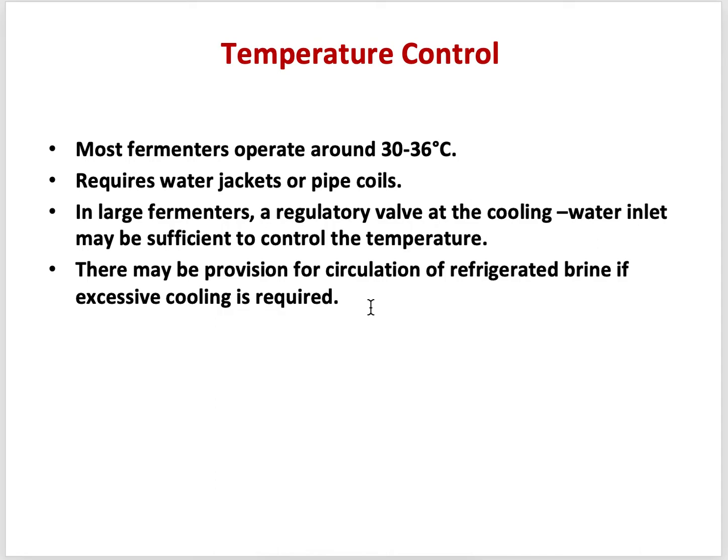So usually in the fermenter, the cooling is done by water. Water is used as coolant there, but sometimes a particular fermentation process produces excessive heat, and in that case water alone is not enough to cool the fermenter. So in that case refrigerated brines can be used. Refrigerated brines are more efficient coolants than water.